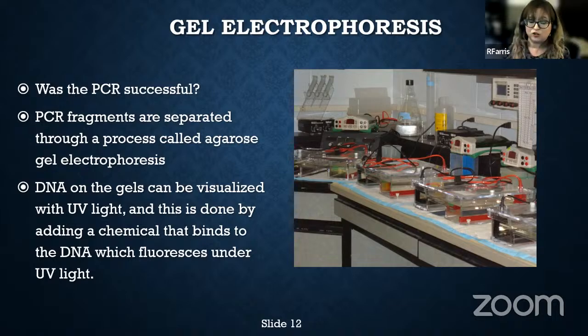So what we need to do is visualize these PCR products by using agarose gel electrophoresis. And so this is a system where we load our PCR fragments onto an agarose gel. It pretty much looks like Jello, but imagine clear Jello with little tiny holes in the Jello so you can load your little product onto the gel.